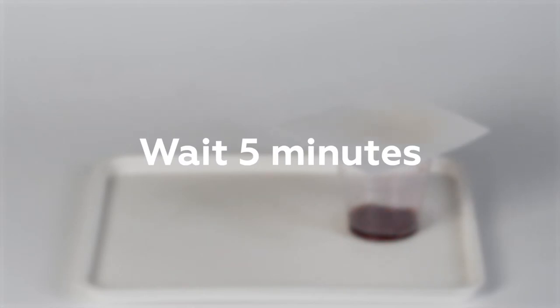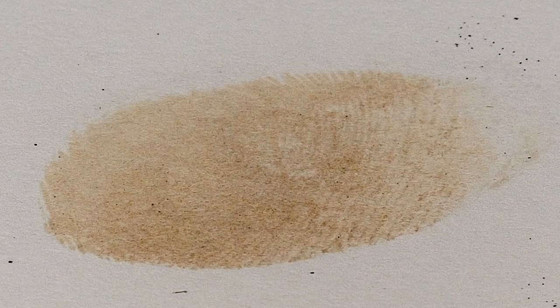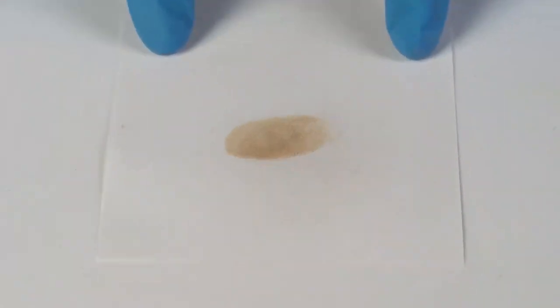Hydrogen peroxide reacts with potassium iodide to form elemental iodine. The lines of the fingerprint contain an oily residue, which dissolves the iodine vapor. This is why the fingerprint becomes visible on the paper.